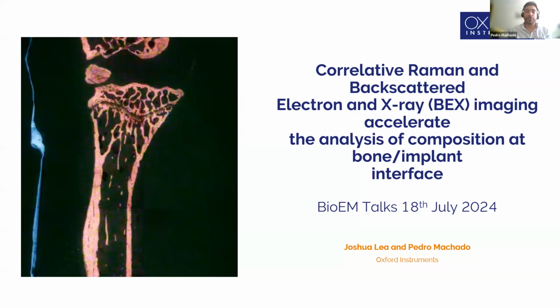But today I wanted to talk to you a little bit about the correlative workflow using Raman and backscattered electron and X-ray imaging for analyzing the composition of the bone implant interface.